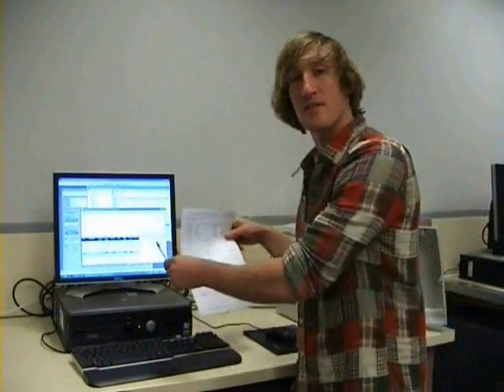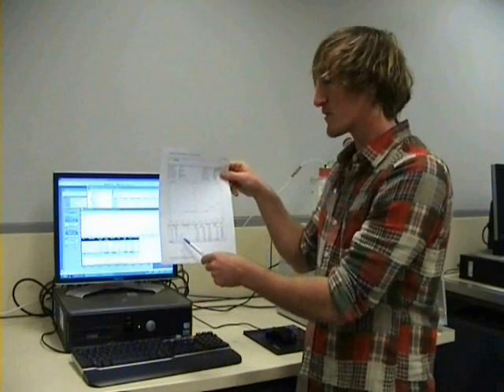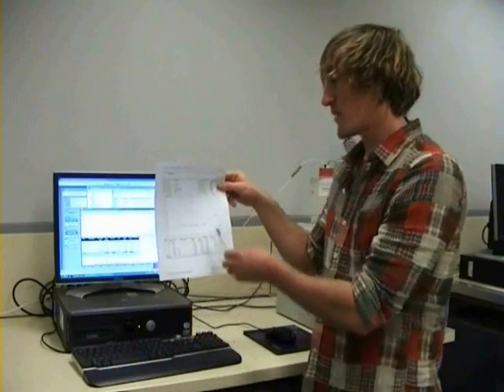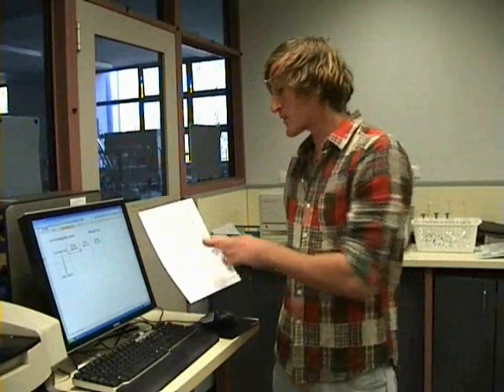After we click print on the interface, this is what the raw output will look like. There are two things that are the main concern for us: the retention time, which corresponds to the time the analytes take to come off the chromatographic column, and also the peak area, which corresponds to the concentration of analytes in solution. The first step we do with our raw output is determine which peaks correspond to the different analytes in our solution.